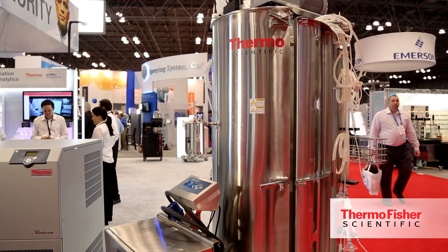This is Thermo Scientific's high-performance, single-use fermentor. This is the first kind of single-use fermentor on the market which is purpose-built, especially for microbial organisms. The microorganisms like bacteria and yeast cells that we grow in this are much different from mammalian cell culture.